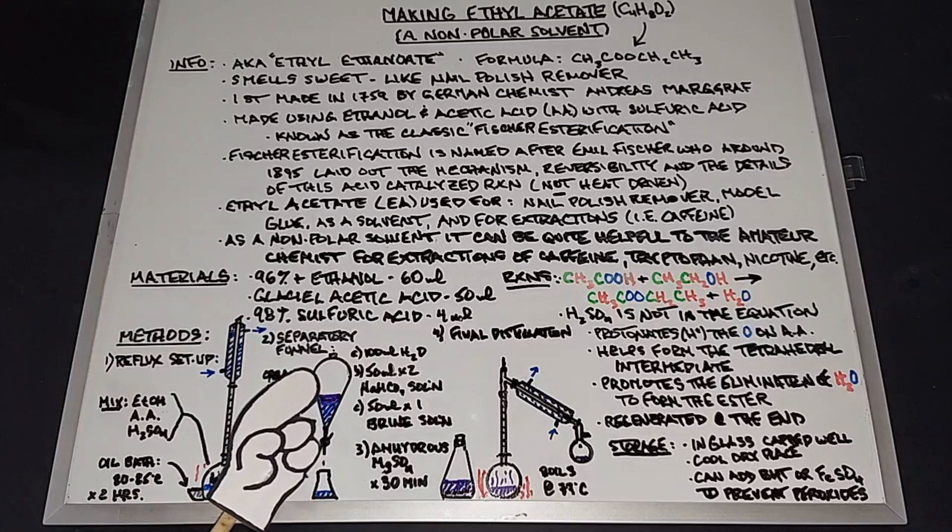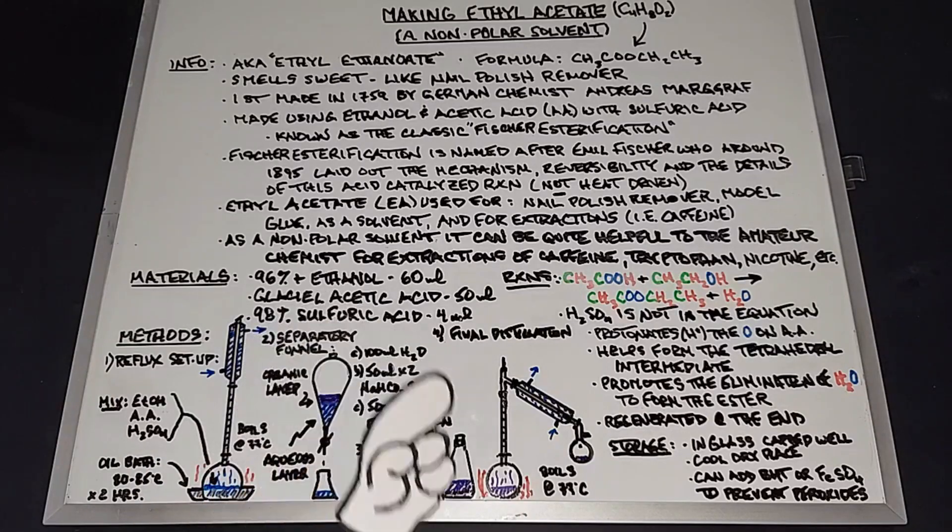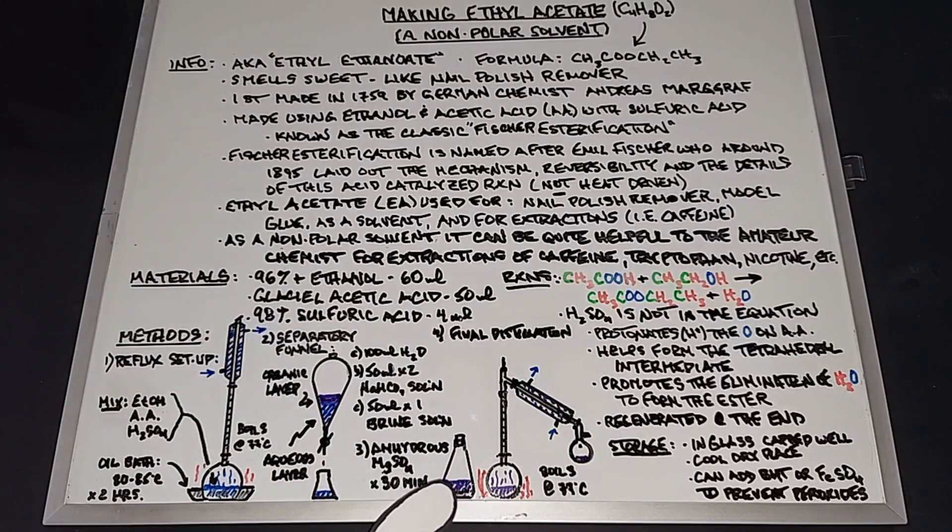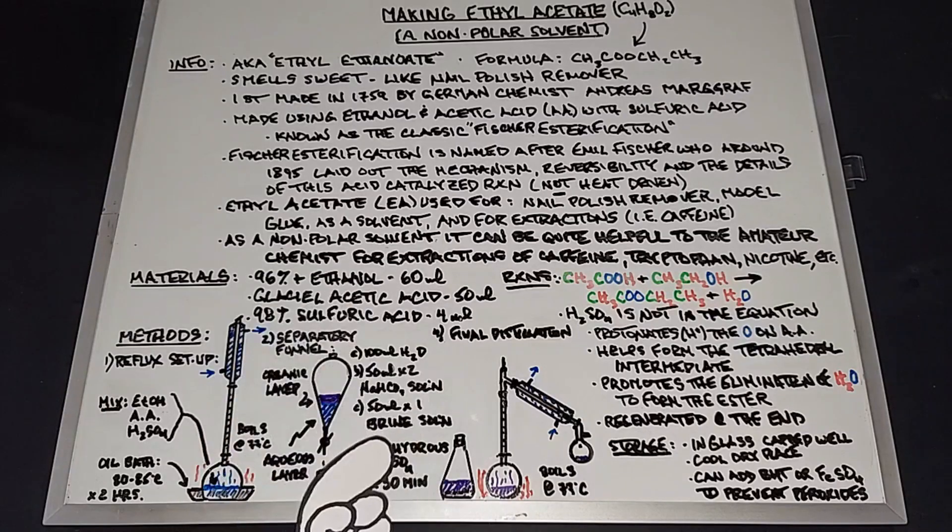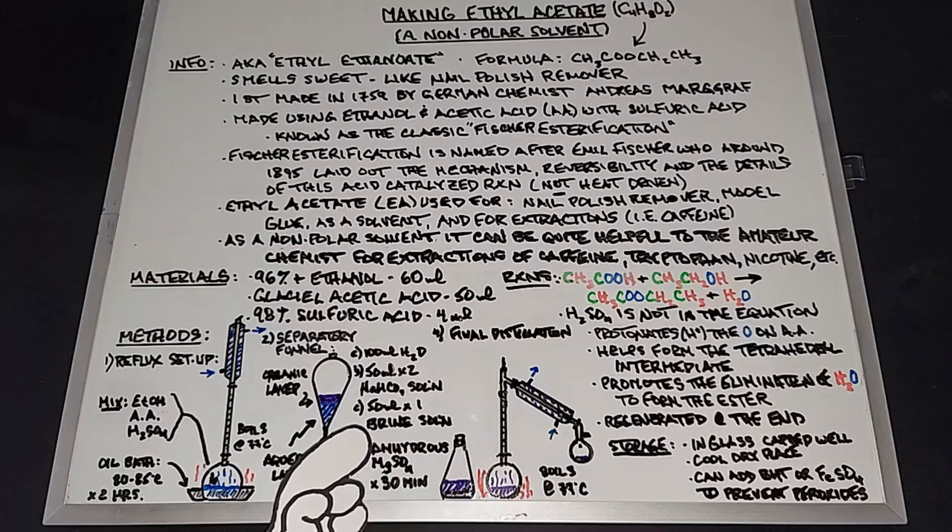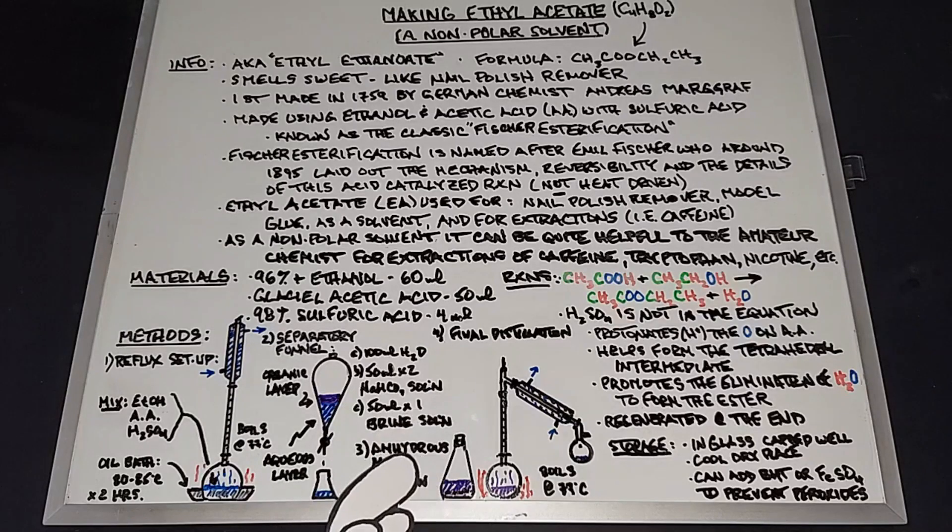We'll finally drain the organic layer into another container, which will be a flask. Inside this flask, we'll have the anhydrous magnesium sulfate, which works really well for this experiment. You can use calcium chloride, but anhydrous magnesium sulfate works a little bit better. We're going to leave it in there for 30 minutes capped, hopefully absorbing most, if not all of the last bits of water.